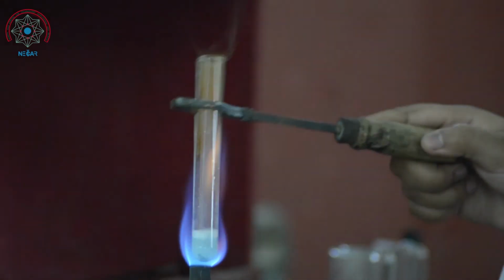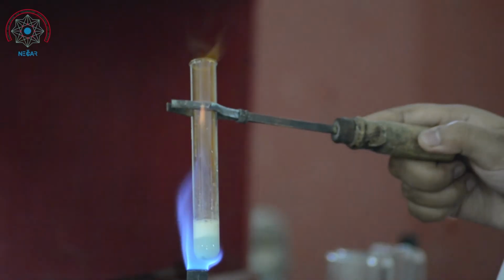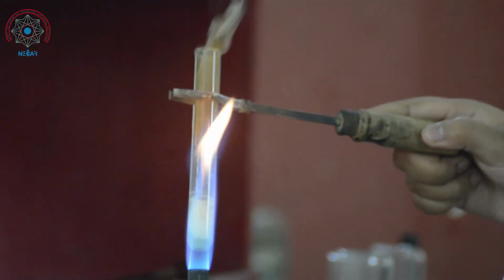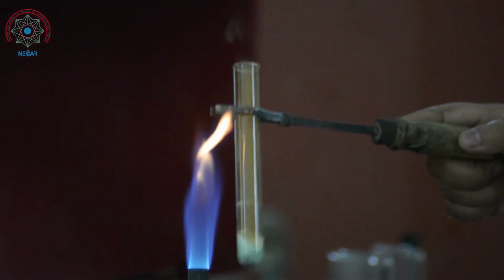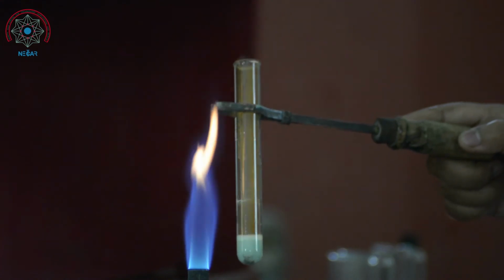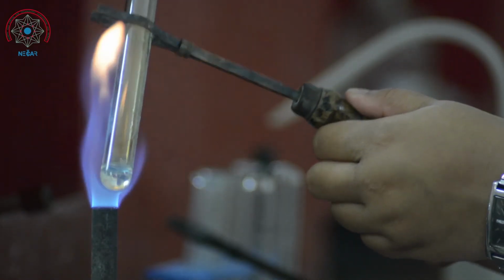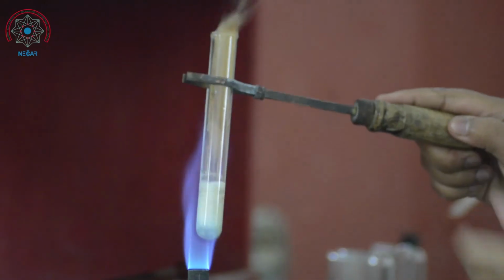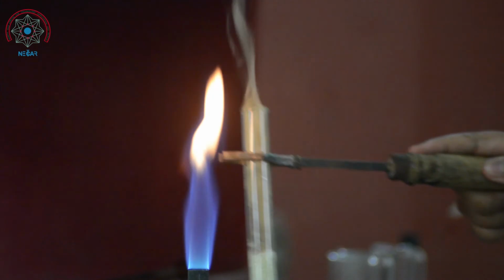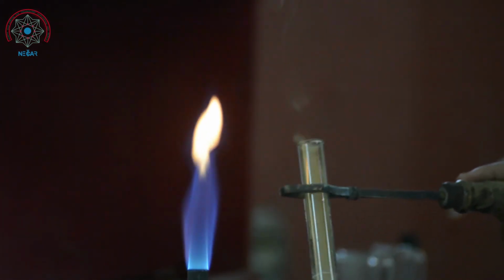When we see the brown fumes, we add copper turnings to the solution, and the brown fume intensity increases. With this, we can say that the salt contains nitrate ion. This is the evolution of brown fumes. The brown fume intensity increases with the addition of copper turnings.